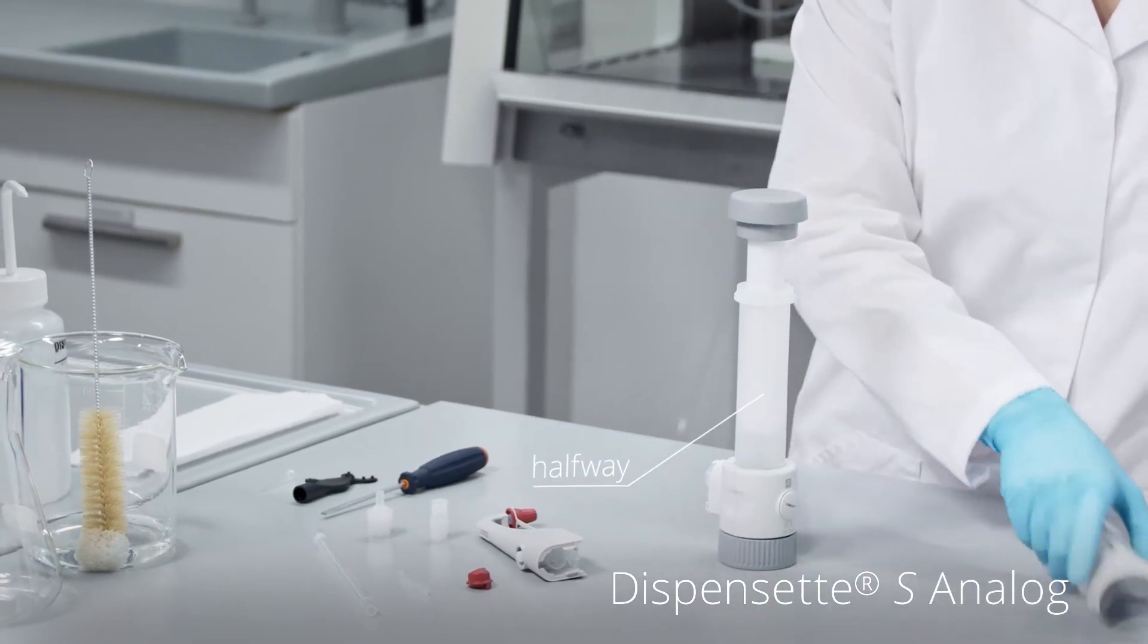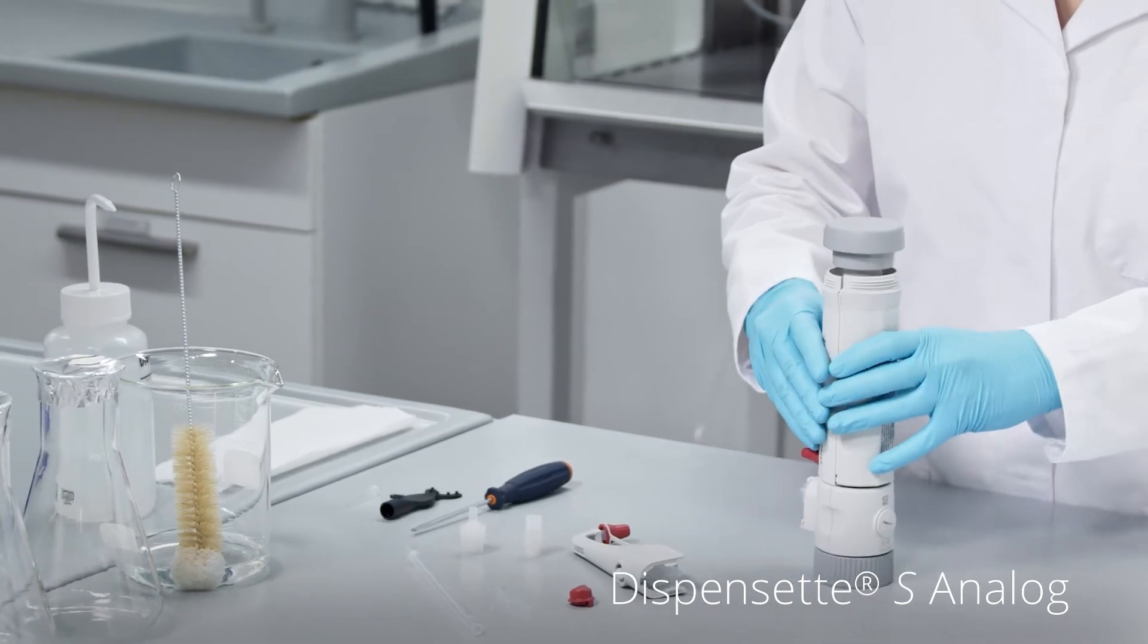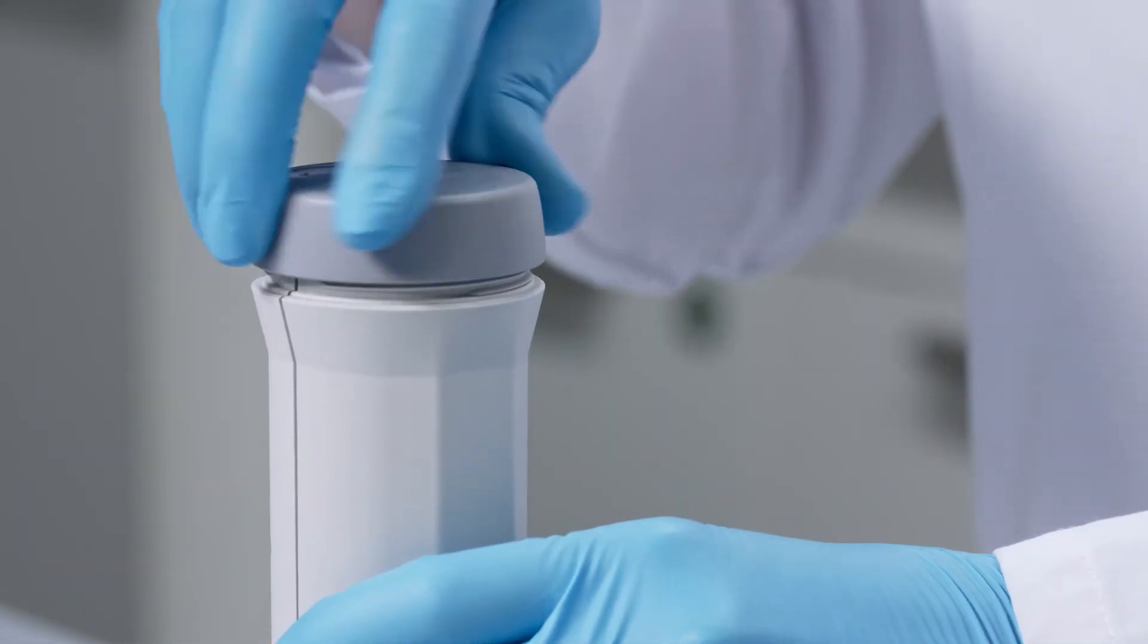For analog models, insert the piston halfway into the cylinder and reassemble the housing. Screw the piston seat into the housing.